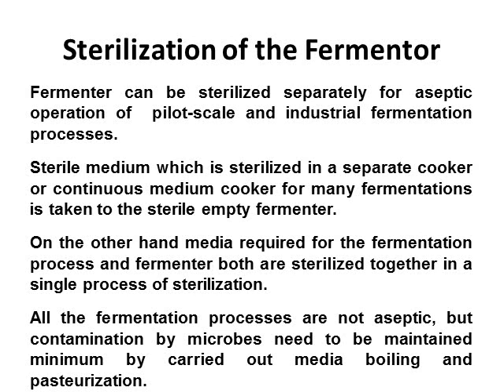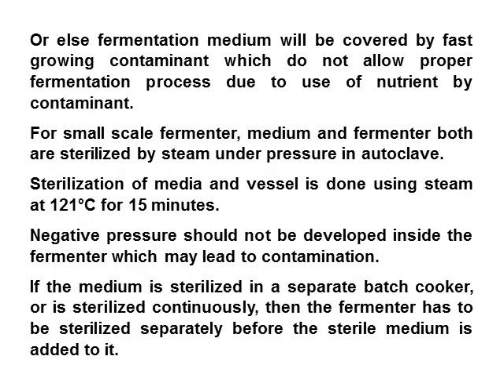Not all fermentation processes are aseptic, but contamination by microbes needs to be kept to a minimum, by carrying out media boiling and pasteurization. Or else the fermentation medium will be overtaken by fast-growing contaminants, which do not allow the proper fermentation process, due to use of nutrients by the contaminants.